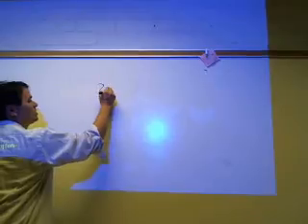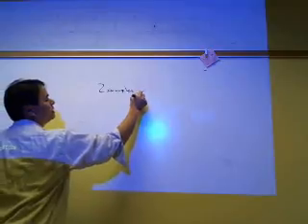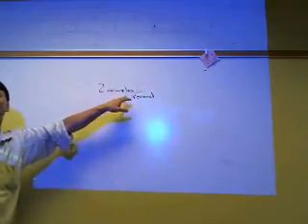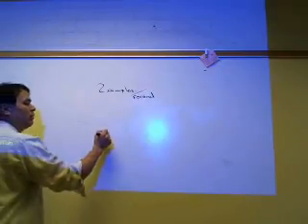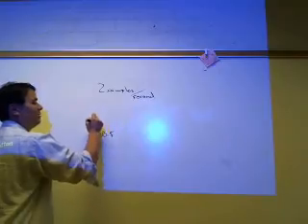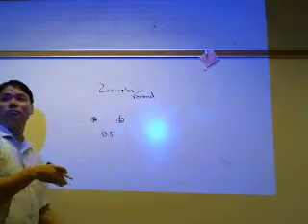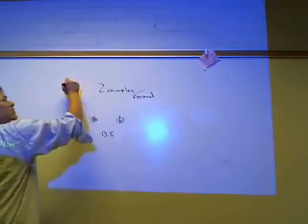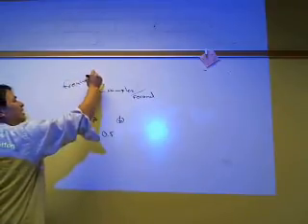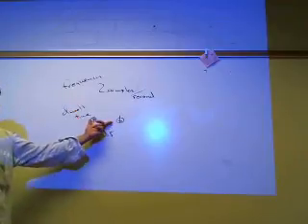Let's say if we collect 2 samples per second, what is the interval between? The 0.5. So every 0.5 seconds, we take a measurement. If we do that, that gives us two data points per second. We have what's called the sampling frequency here, and we have something called the dwell time here, and you can set either.